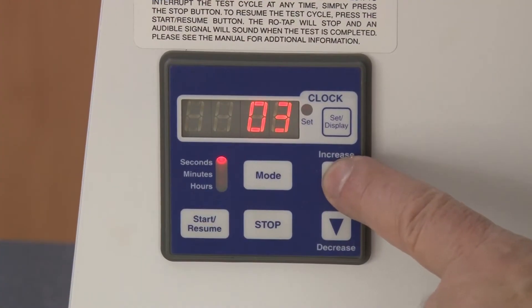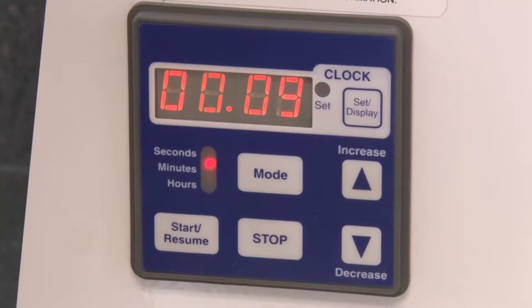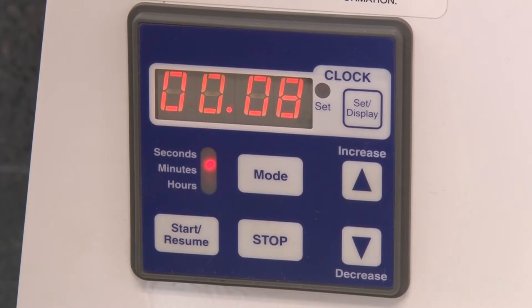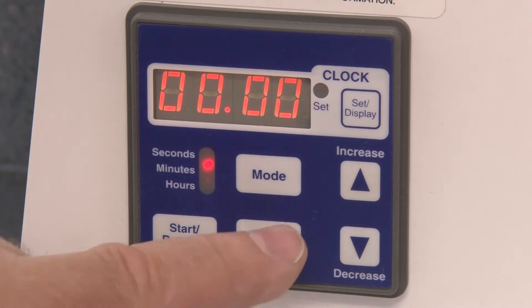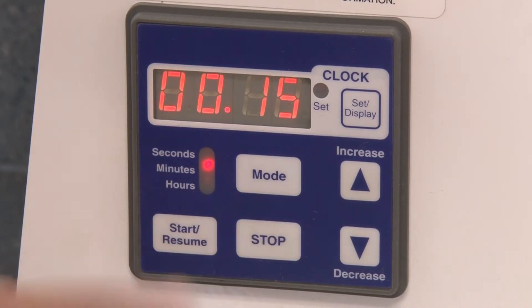The digital timer features a large LED display and a mid-cycle pause function. And for convenience, once the cycle is completed, the timer will automatically reset to the most recent test time.